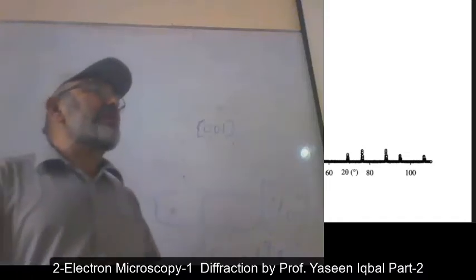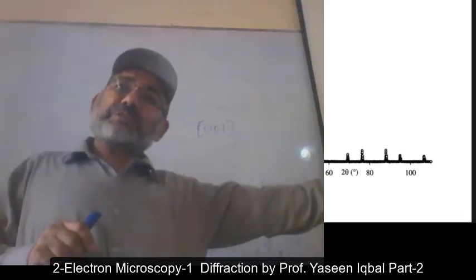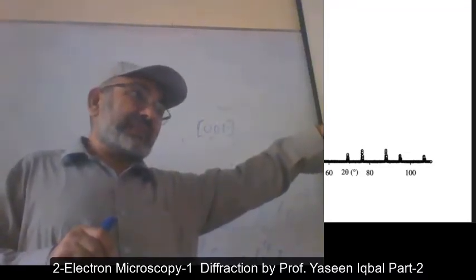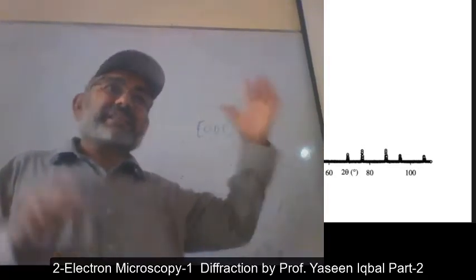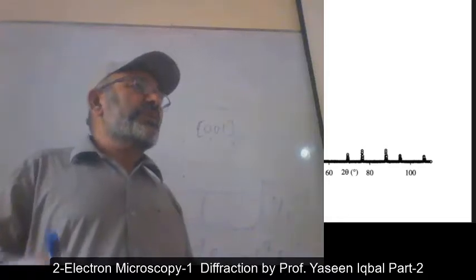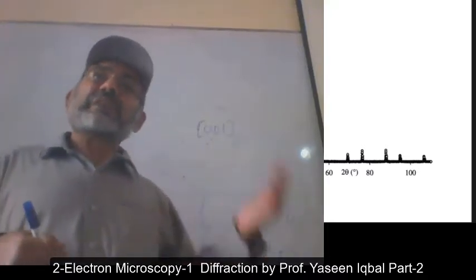A person who is not properly trained uses the microscope and gives you the result. Your first question should be, was the microscope at the correct eccentric height? Was that correction made? If no, then you can't rely on that result. The second thing I told you yesterday is, has the microscope been calibrated? If there is no calibration, then you are wasting your time.